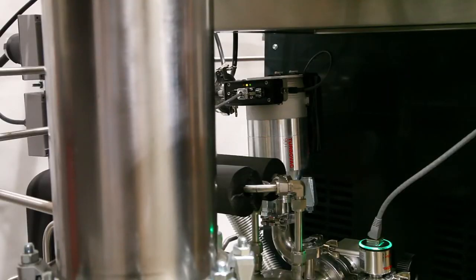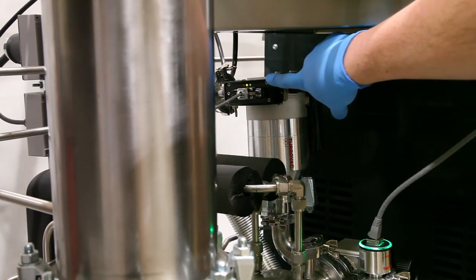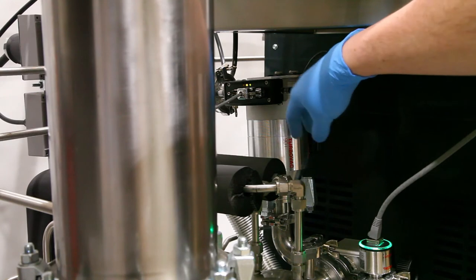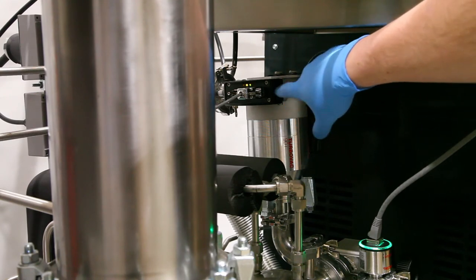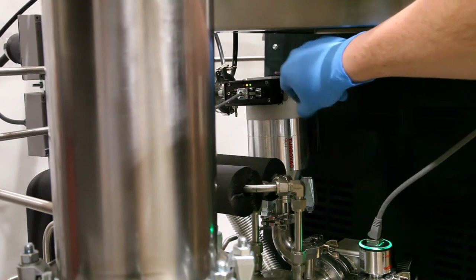When your turbo molecular pump is turned on, what you'll see is the green light here will blink until it gets to its full RPM, and once it gets to its full RPM the green light will be solid.